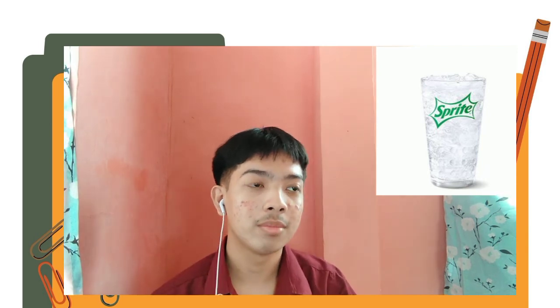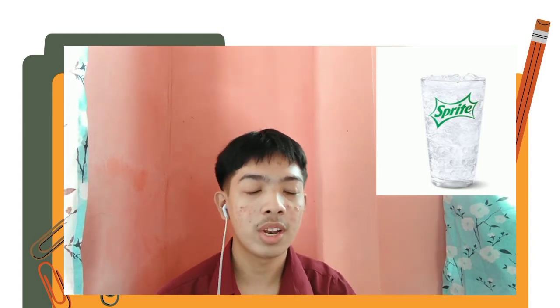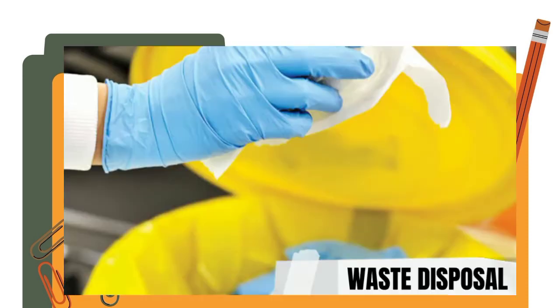So, hindi lang naman doon natatapos yung process ng pag-experiment natin. Kasi after nun, may mga observation pa mangyayari, like, kung anong nangyayari doon sa ating mixture, and so on and so forth. And after natin mag-experiment, of course, mag-proceed tayo sa waste disposal. We need to dispose our wastes properly. Kasi, of course, gumamit din tayo ng mga chemicals or mixtures na pwedeng magpahamak sa mga kasama natin and to our environment.